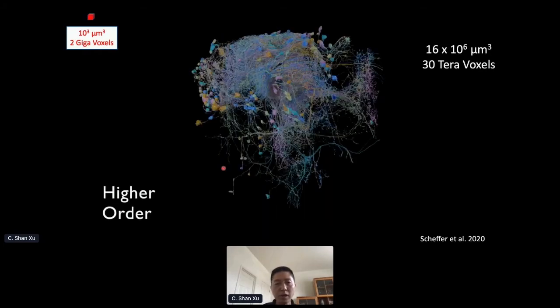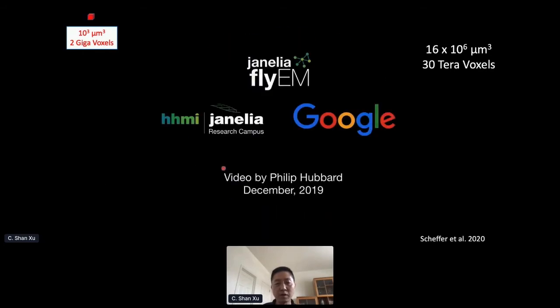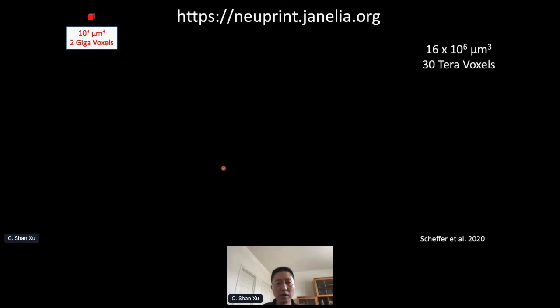Everything here, both the raw data and the segmented version, is openly available to the public. You can go to neuprint.janelia.org, the website, to browse it during the free time that you have.